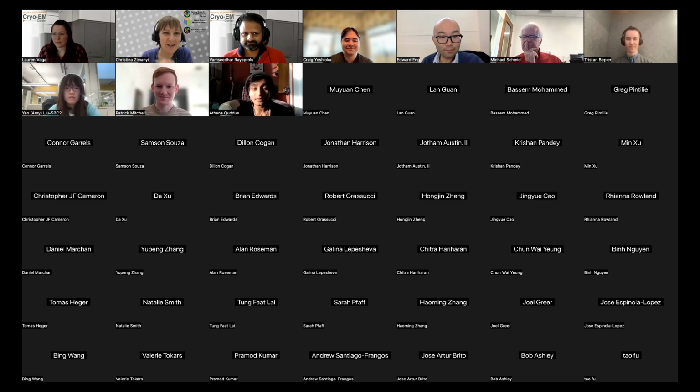So I actually have a question. I'll start with a question for Craig. Craig, you said you like to dabble, and I would say at NYSBC we have a bit of a bias towards Topaz. But I guess you've probably dabbled in multiple things, so what would you say are the biggest differences practically between using the different neural network pickers that are available?